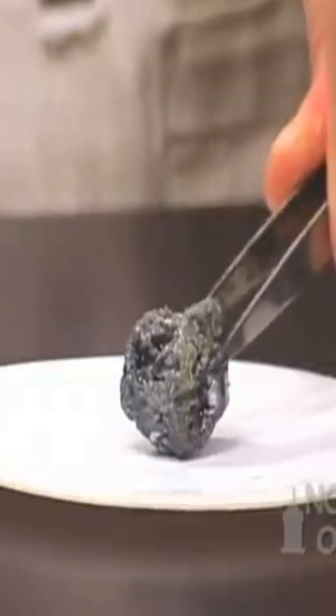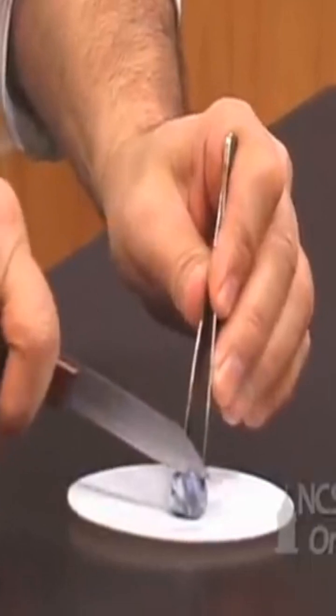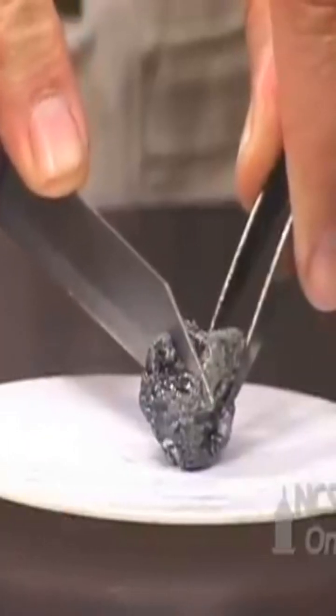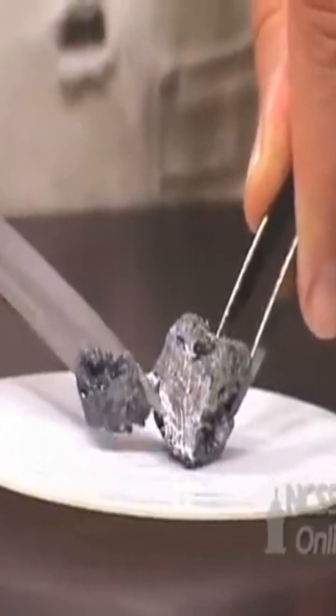As we continue down the column, group 1 metals get softer and softer. The potassium cuts very easily. As we cut through the metal, we expose the shiny metal surface underneath.